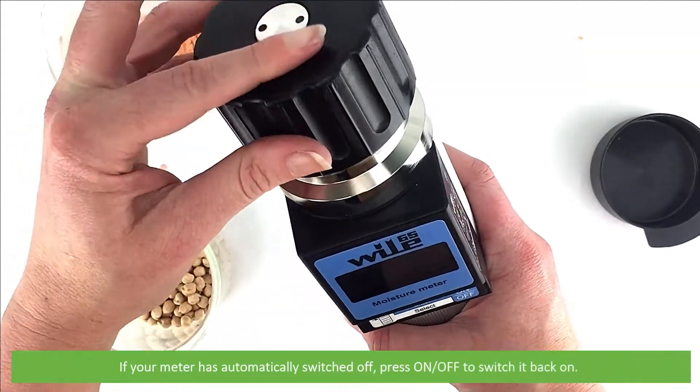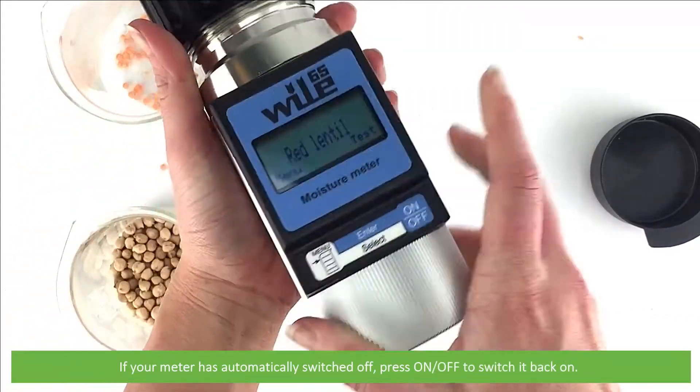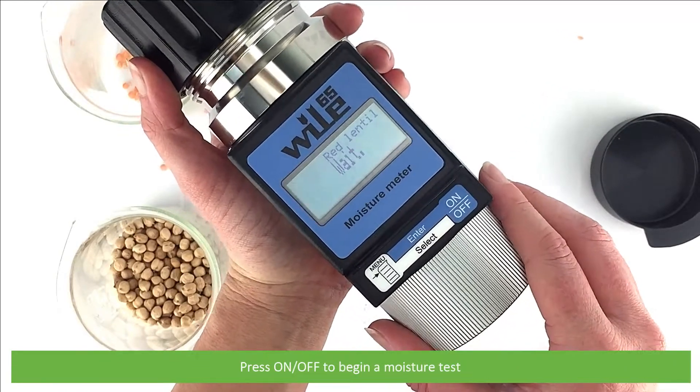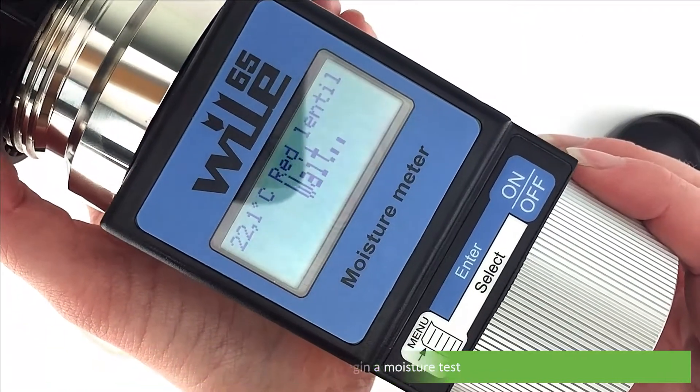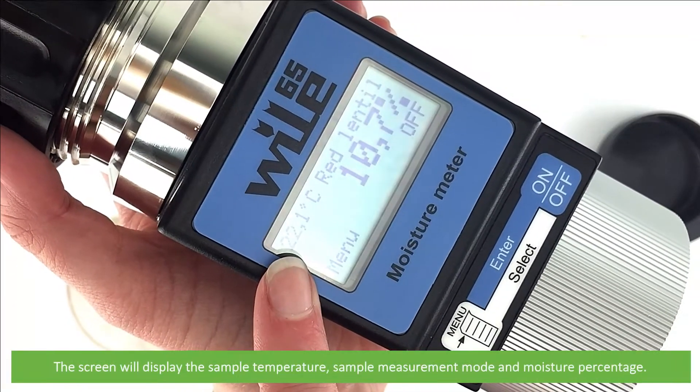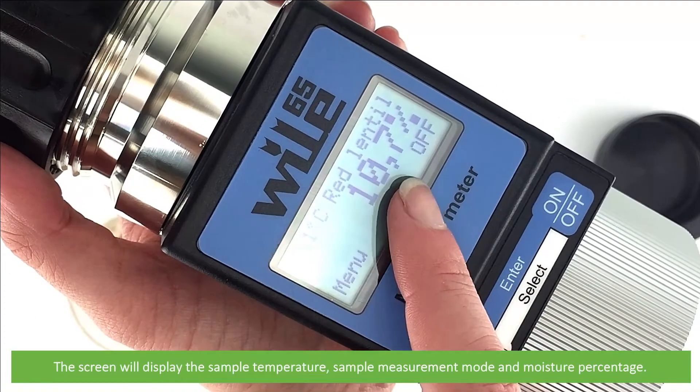If your meter has automatically switched off during this time, press on/off to switch it back on. Then press on/off to begin a moisture test. Within a couple of seconds the measurement is complete. The screen will display the sample temperature, the sample measurement mode and the moisture percentage.